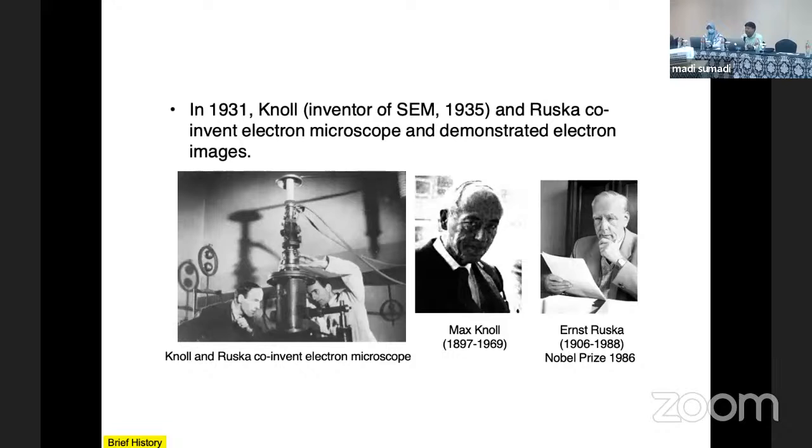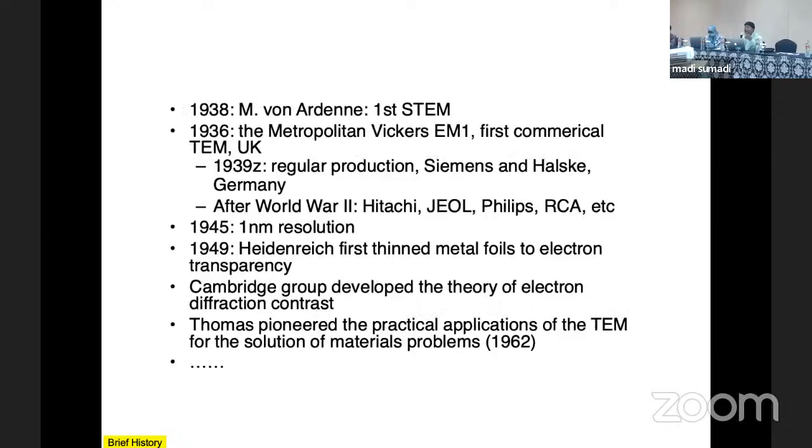And colleagues, now they discovered this scanning electron microscope and also the electron microscope. Having known all those dots, they connected them and made the first generation of the electron microscope. From there, I think the serial developments that you see, or actual inventions, were already made. It's a kind of technical improvements: converting the images to digital images, decreasing the size, increasing the resolution, and all those points have been made.